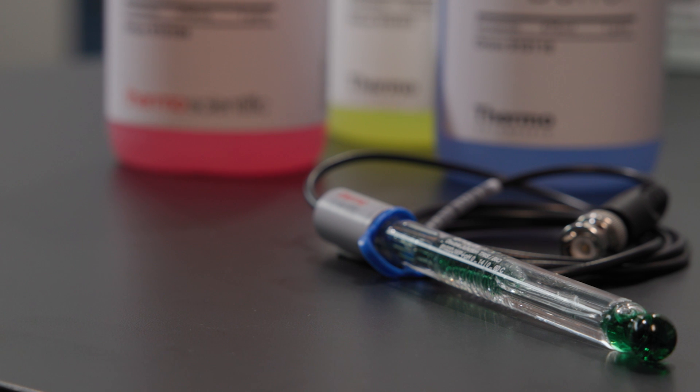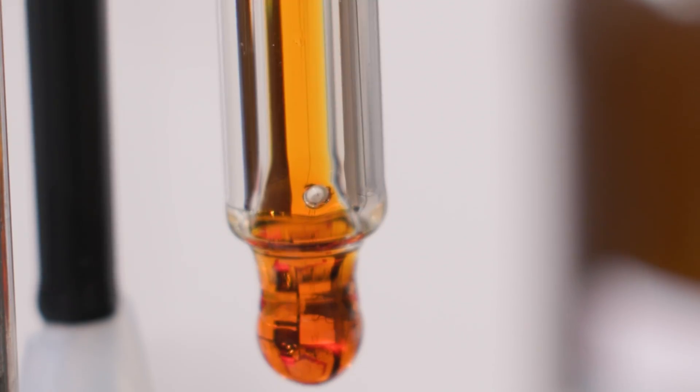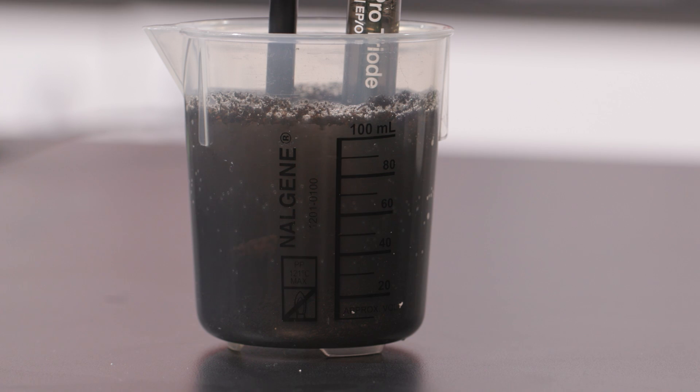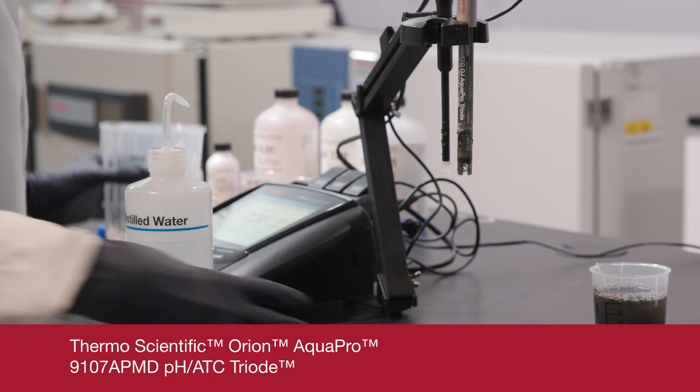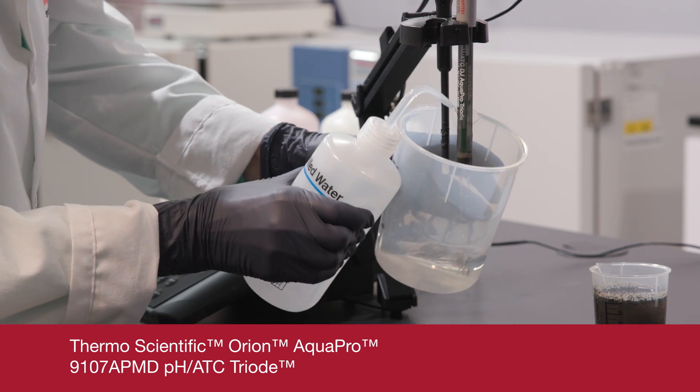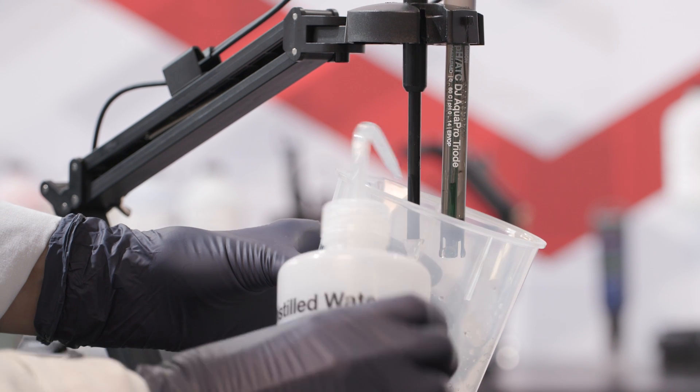Samples containing particulates can be problematic for certain electrodes. For example, glass electrodes with porous ceramic reference junctions can be blocked by particulates. This disrupts the reference signal and can lead to unstable readings. Epoxy electrodes with wick junctions can be affected too — yet another reason to make an informed pH electrode purchase. This can be solved with an open, capillary, renewable, or flushable junction electrode, which resists blockage and allows particulates to be flushed or rinsed away.